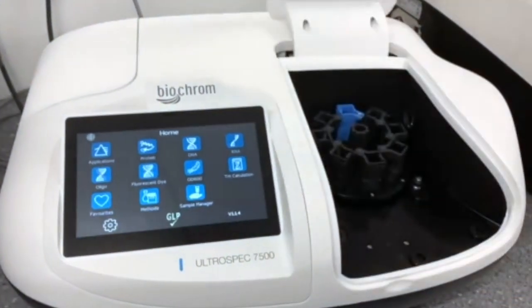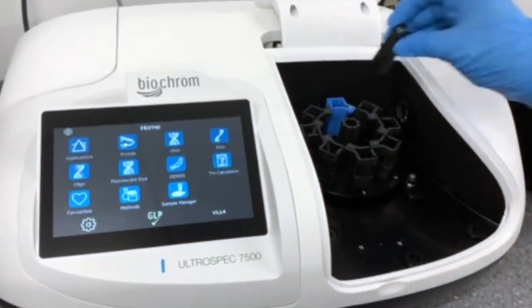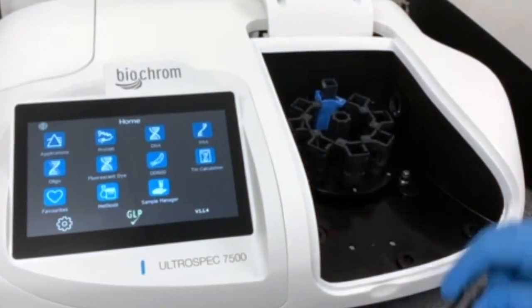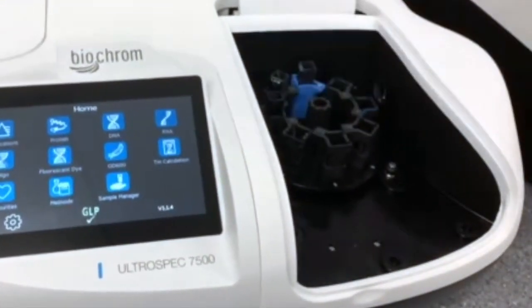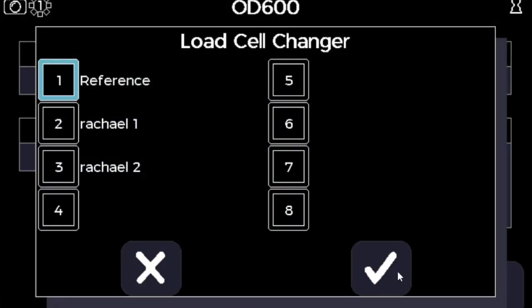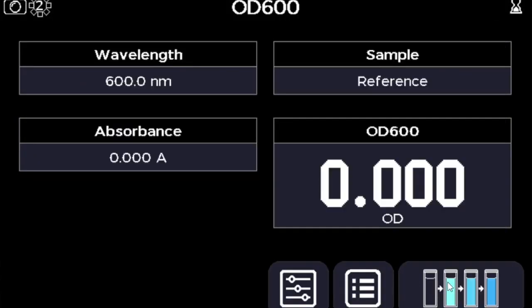When you open the lid you will notice there is one blue cell. That blue cell is the reference cell, and it's the number one sample position if you're not using it as a reference — so that's always your starting point. I'm using quartz cuvettes here, but you can actually use any cuvettes that are appropriate for the sample type you're using.